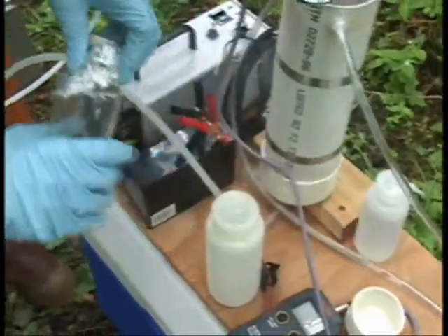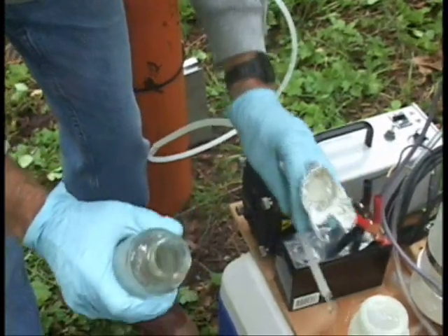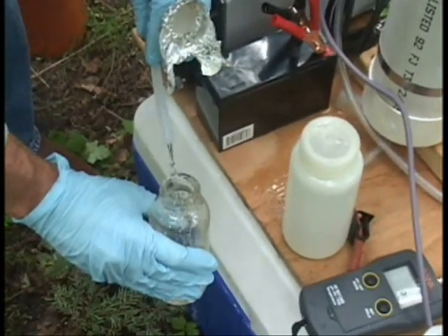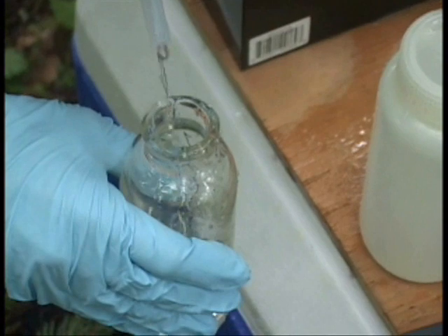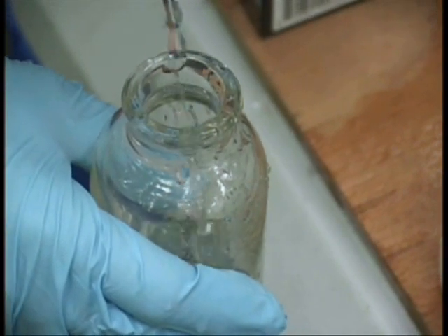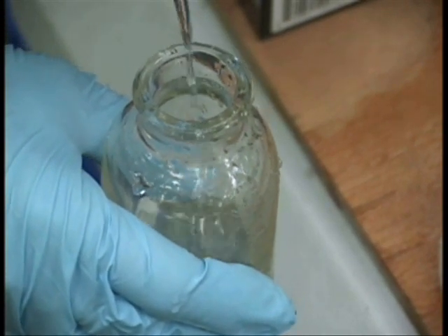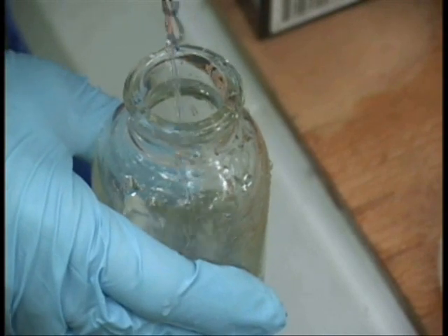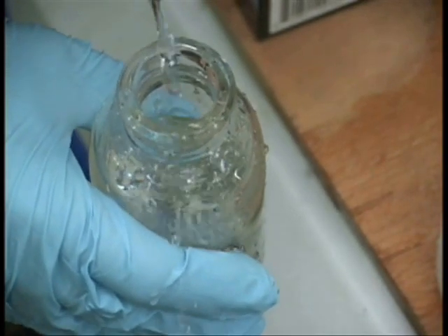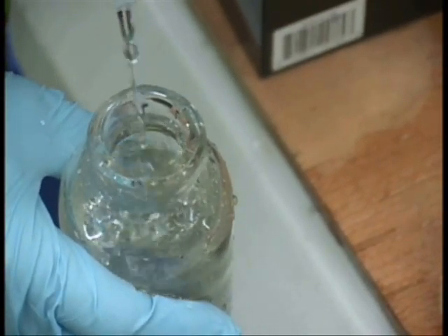Now we'll go to the bacteriologic sample. You don't want to touch the inside surface of the bottle — no rinsing. Try to minimize the time that it's open so that you minimize contamination by airborne bacteria. You want to leave enough space to go up to the shoulder — leave some air space in there so you don't kill the bacteria.